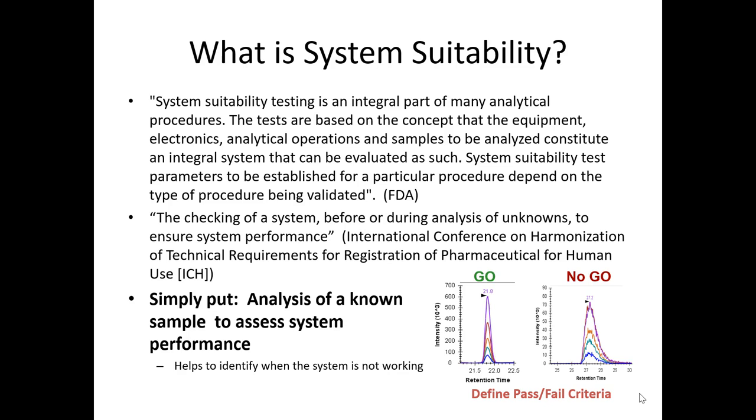It helps you track if there are any changes that are caused by just normal wear and tear, or maybe your vendor decided, hey, we've got a new version of instrument control software, and when you install that, everything goes to crap. It happens, but you don't really know it happens if you're always changing the analytes you're monitoring, or if you have lots of different users in the lab using the instrument. So, simply put, after all these technical definitions: analysis of a known sample to assess system performance.